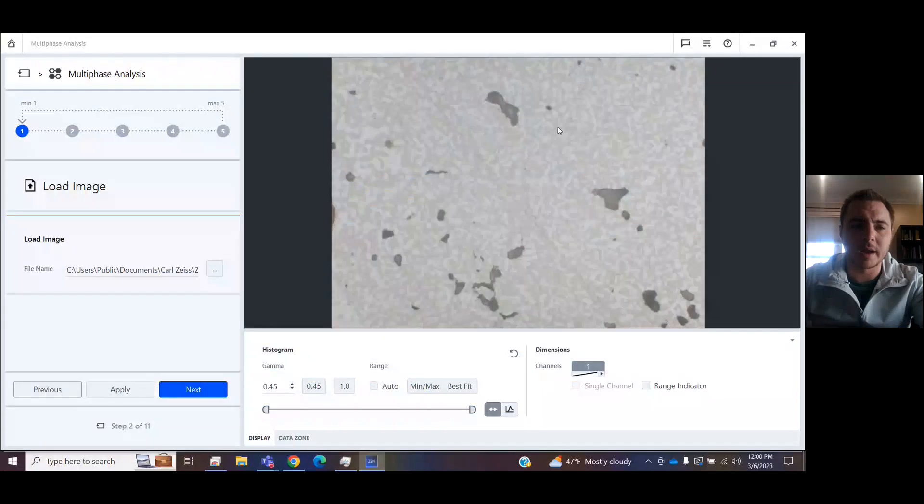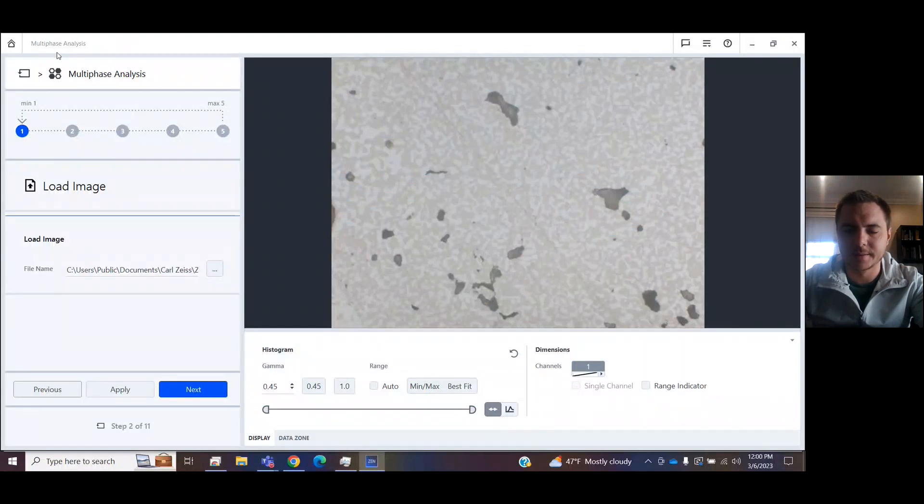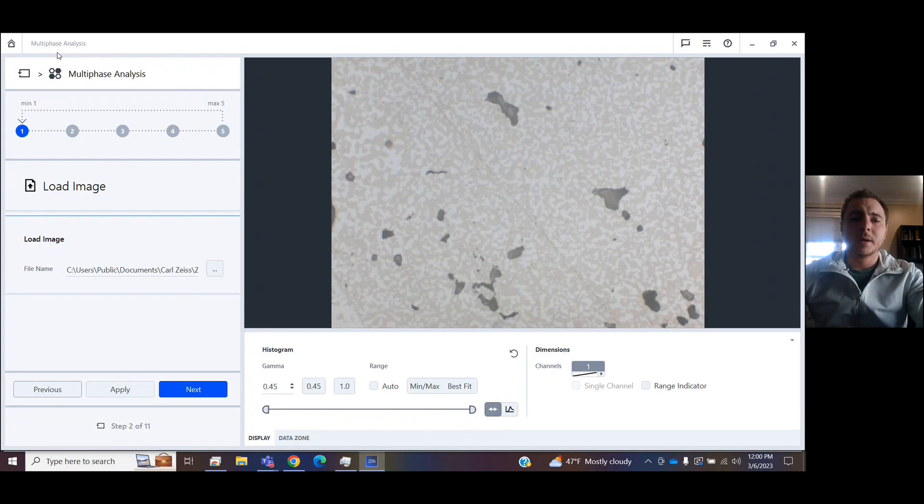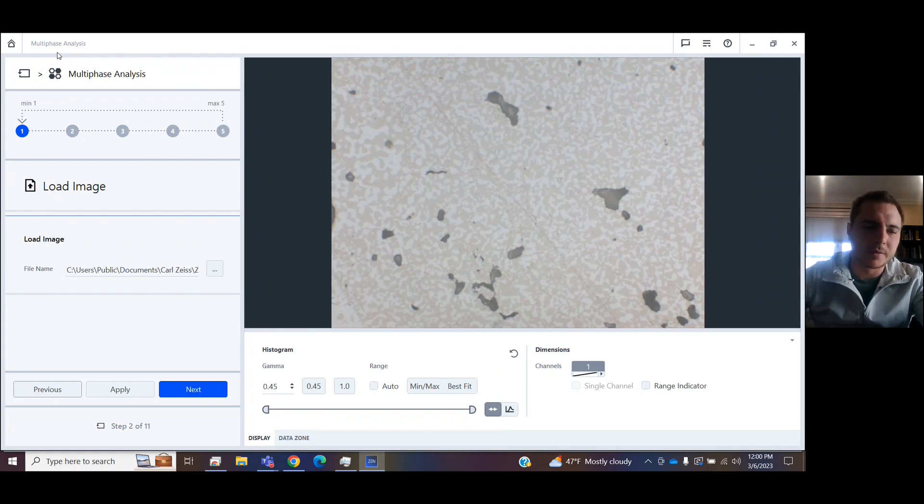So I'm going to share my screen here so we can see my Zen Core. We have this software workflow for multi-phase analysis. So let's go through this and how you can get great results from your samples.